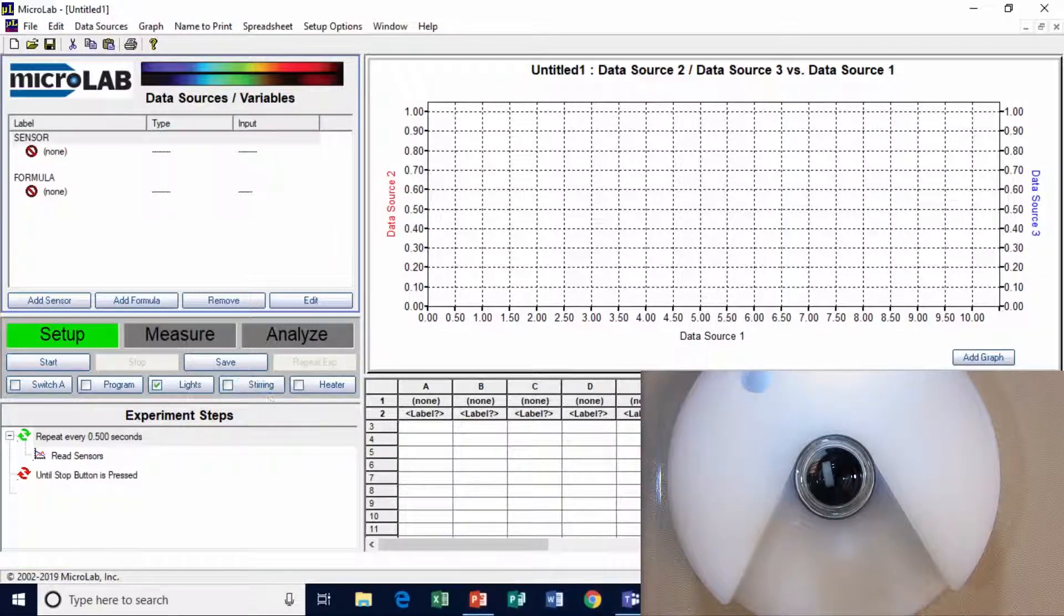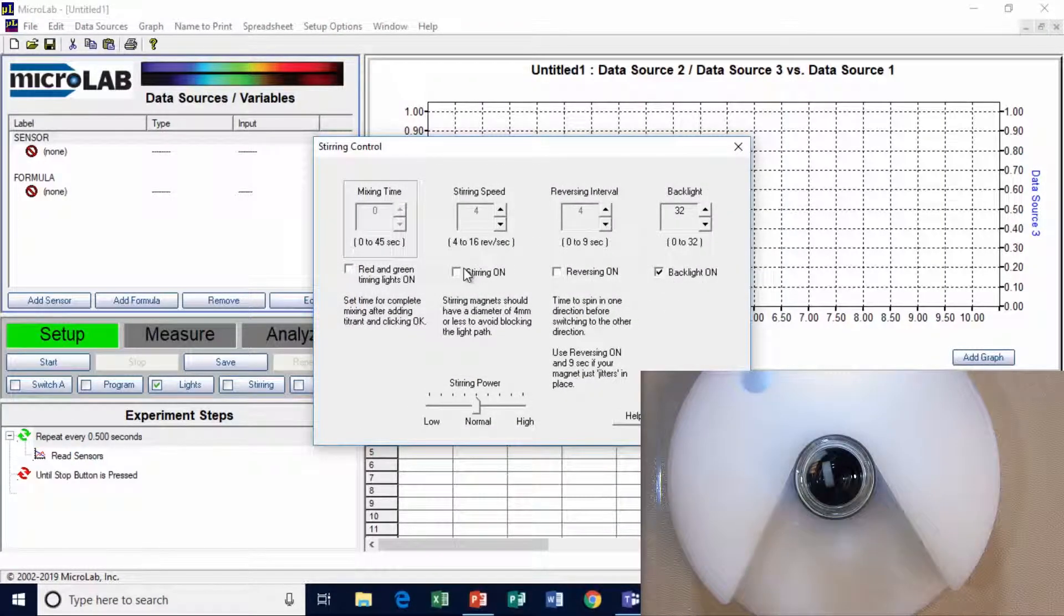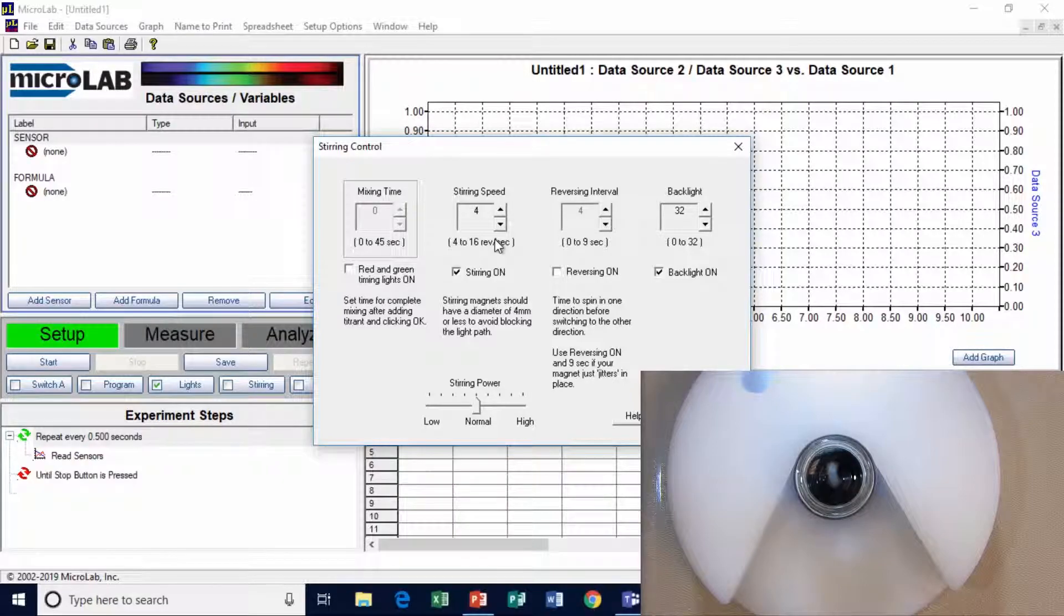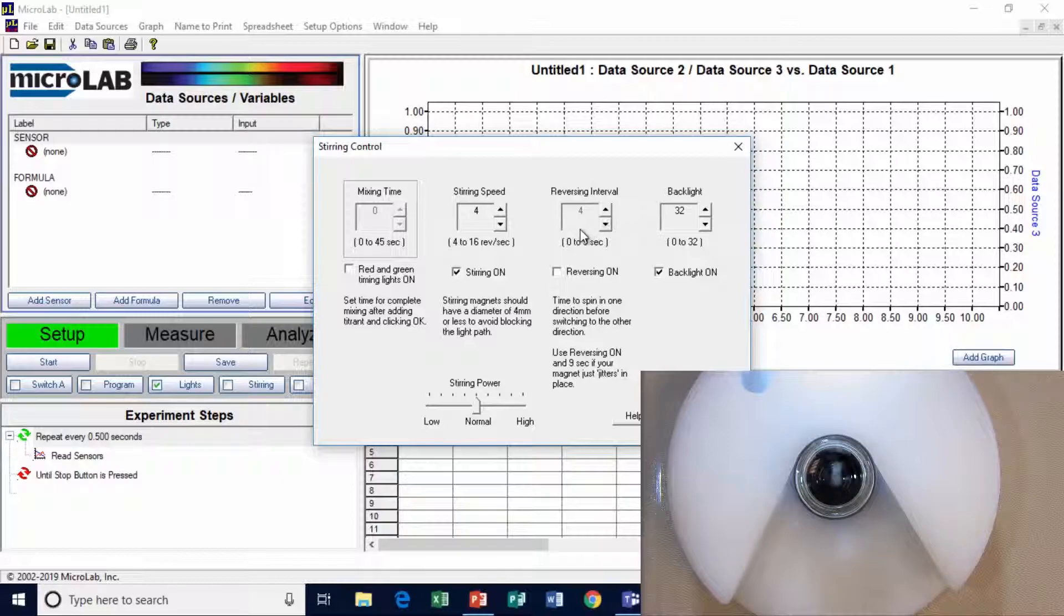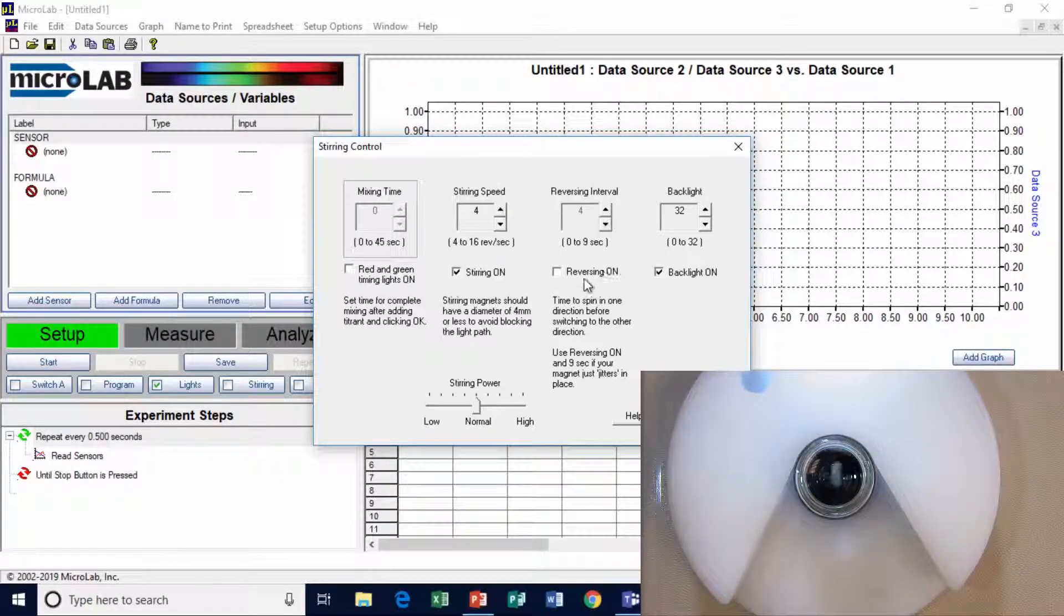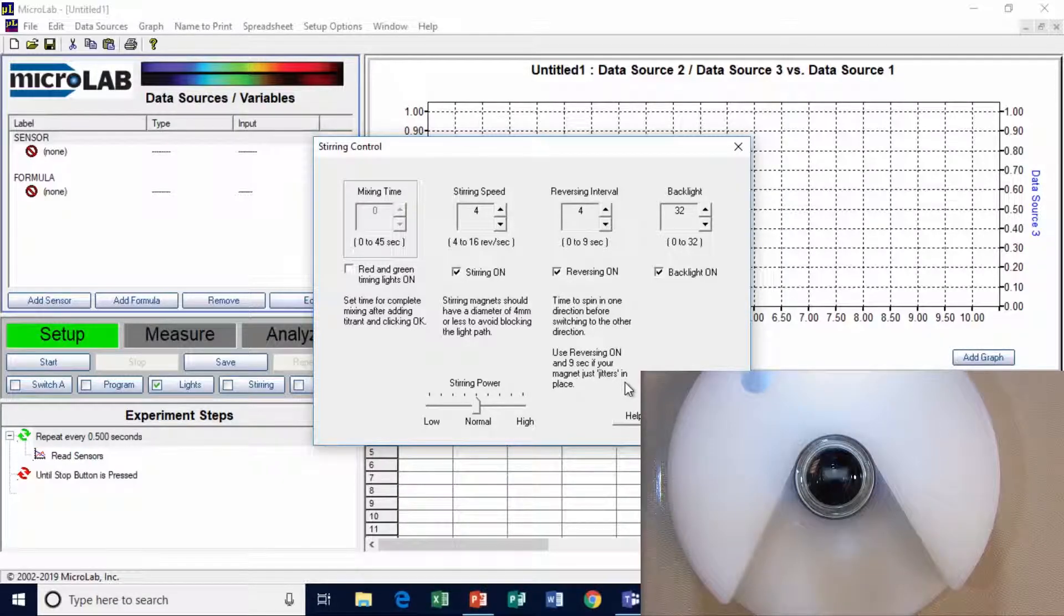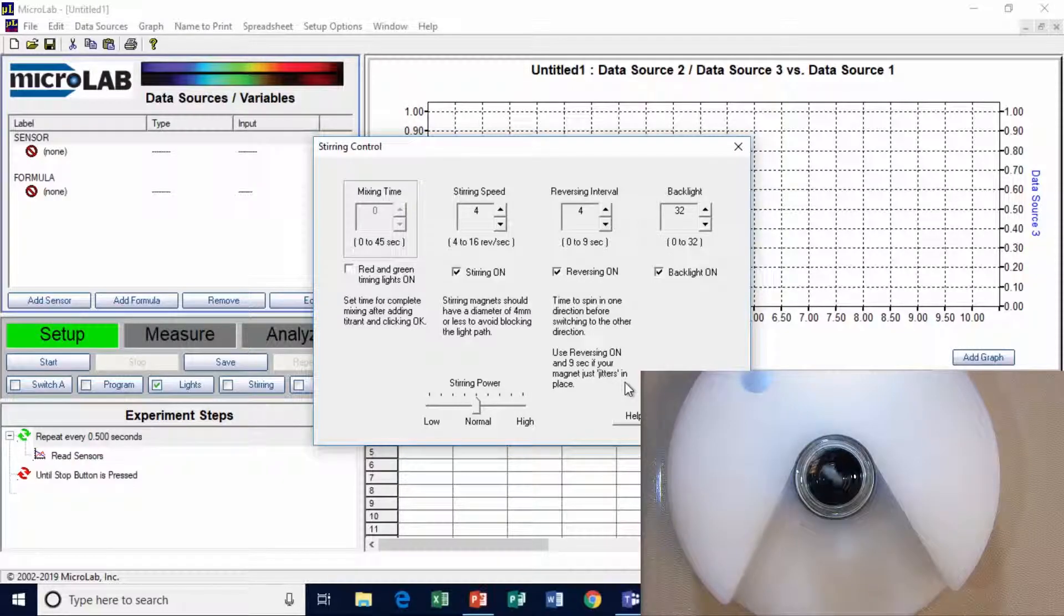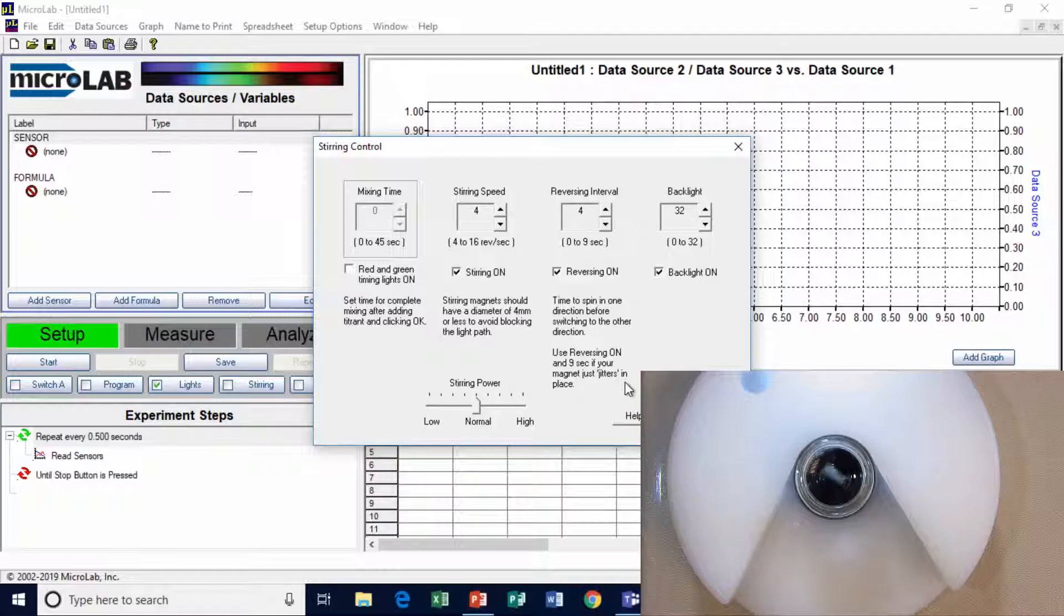I'm going to turn the stirring motor on, and I'll turn stirring on. It's set for four revolutions per second, and you can see it's rotating there. I can make it reverse if I want. A reversing interval is set every four seconds. I'll turn that on. Now watch this. It's going to stop, and then it'll go backwards.